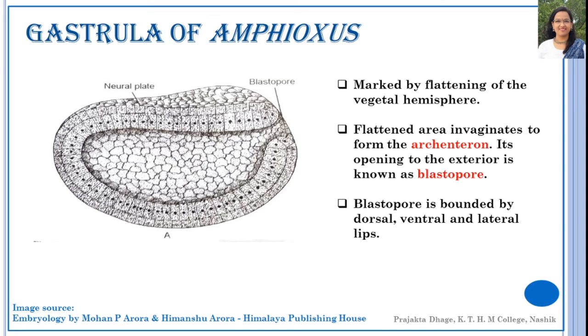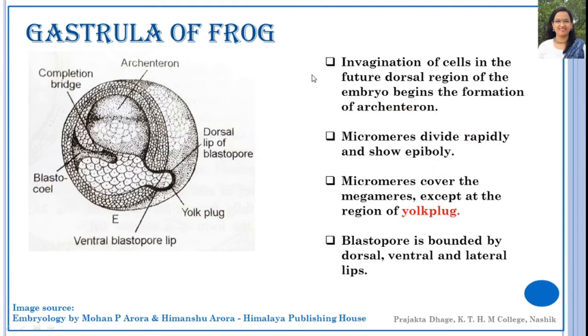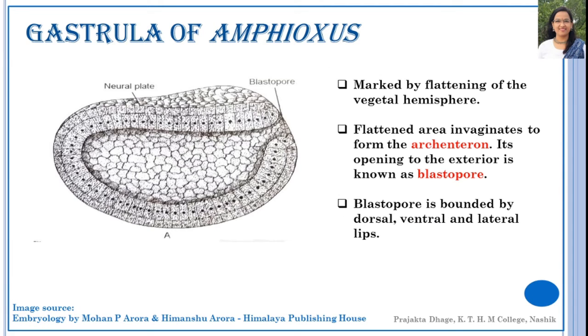So let's begin with the gastrulation in Amphioxus.